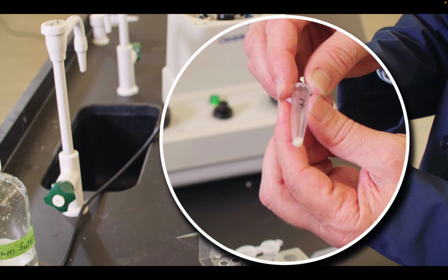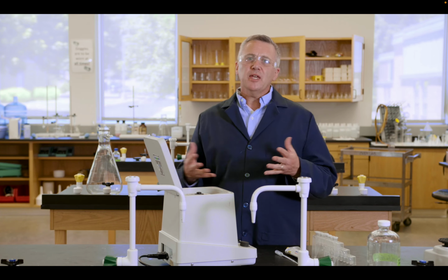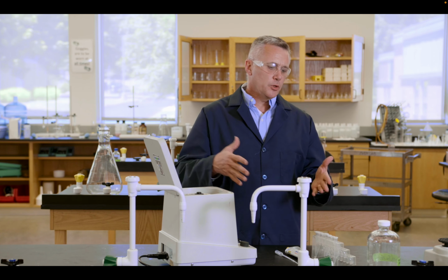All right, so we redissolve this in a little bit of acetate buffer, so usually we're going to stick a little buffer in, and then we'll vortex it, get them all redissolved, and then we'll run our GOT assay. Now, this is the same GOT assay that we just showed you a little while ago, using our spectrophotometer, adding the particular ingredients in buffer, and then assaying it over 4 minutes. All right, so we need to do each one of those for 4 minutes.